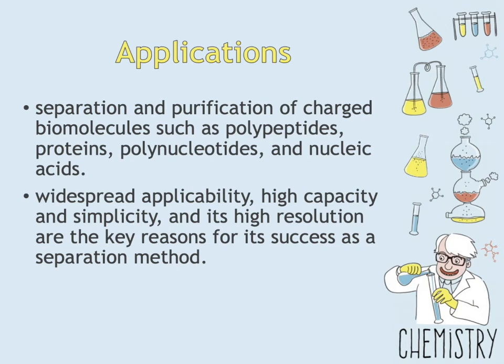Next are the applications. For the applications of ion exchange chromatography, the main purpose is the separation and purification of charged biomolecules such as polypeptides, proteins, polynucleotides, and nucleic acids.